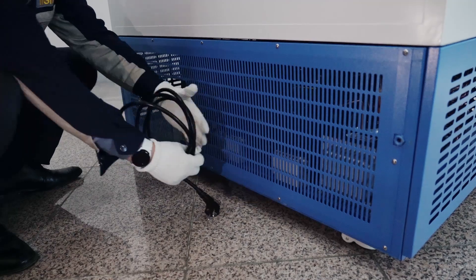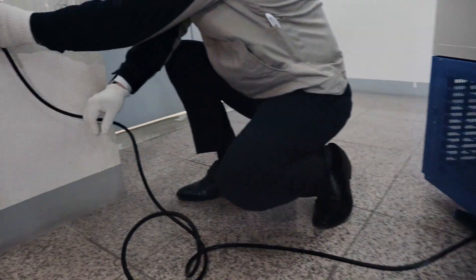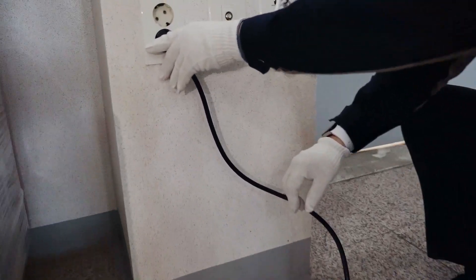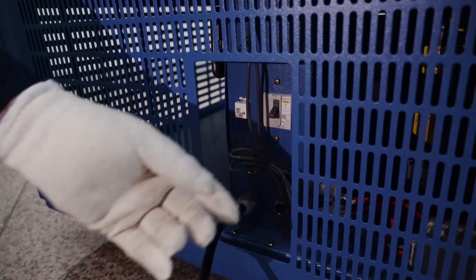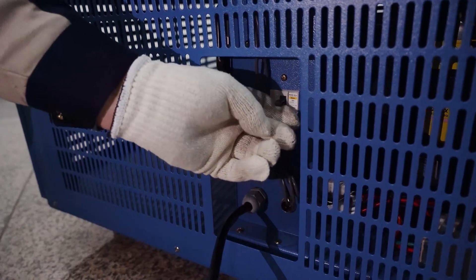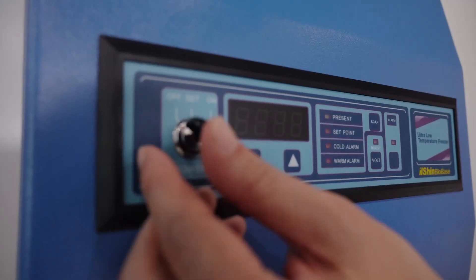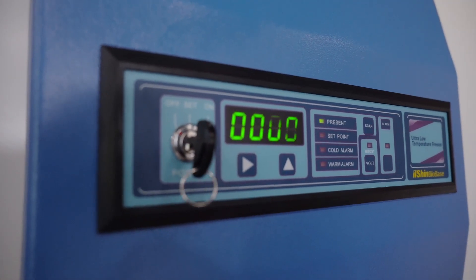First, connect power supply. Power cable is located at rear side near the bottom. Next step is turning on the circuit switch. Then turn on the key at control panel up front.